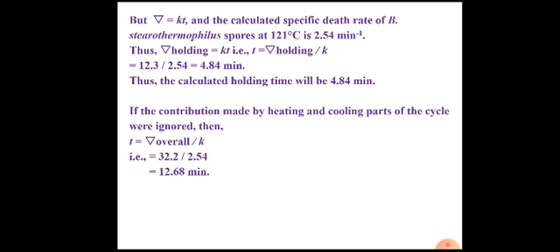It means that now you need to expose your medium to 121 degrees Celsius for 12.68 minutes. What will happen? Degradation of nutrients. That means your medium is getting exposed to 121 degrees Celsius for a much longer period, and that leads to unnecessary exposure.